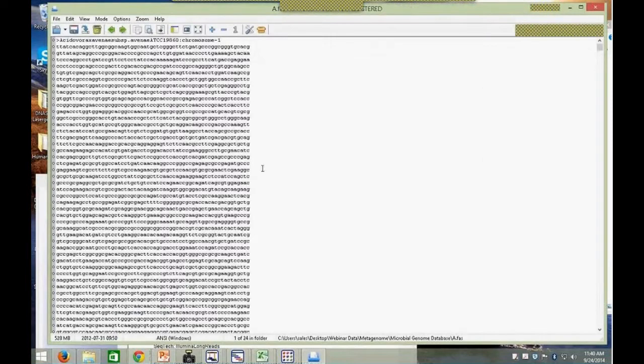So when we use FASTA files, the convention is that the sequence name has this greater than symbol followed by the name of the sequence. And so we edited this to put the species name here, right? And so that's what shows up in our software. Oftentimes, database sequences will have a database ID number there, and then there might be some delimiters with the species name. And so just keep that in mind with this workflow.